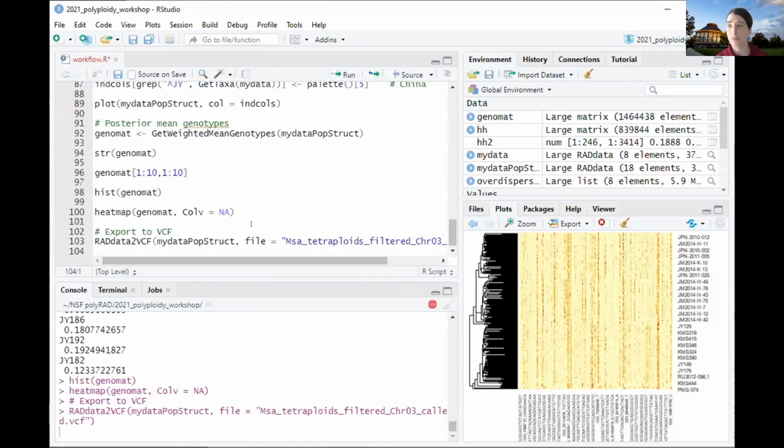And the alternative is that you just have a flat prior and call genotypes directly from the read depth, but then at low read depth, that gets to be a problem because of undersampling of alleles. The lower the read depth is, the more the noise and the more those read depth ratios are going to deviate from the true allelic ratio in the genotype, the true dosage.